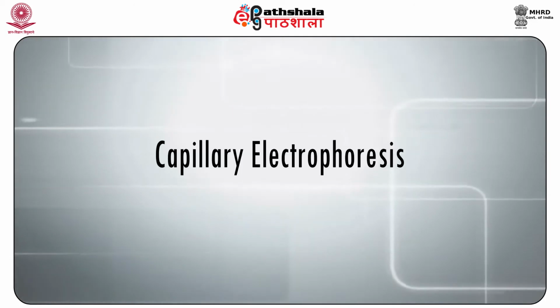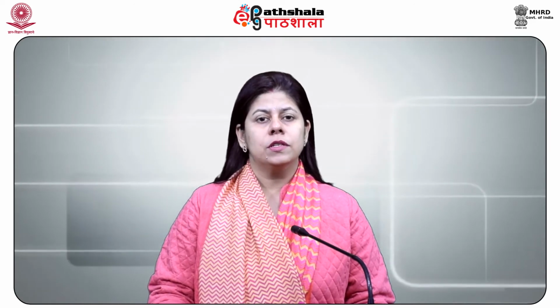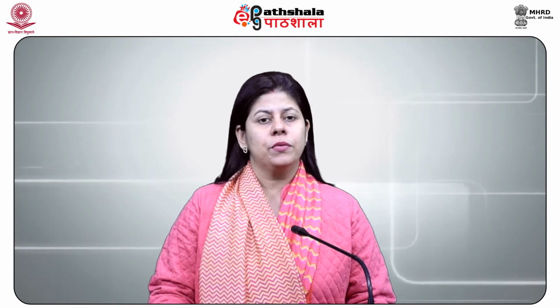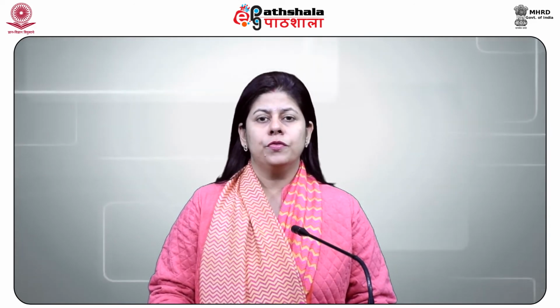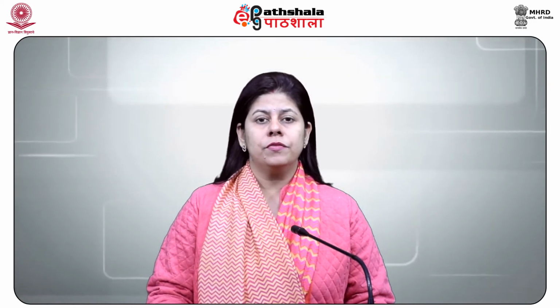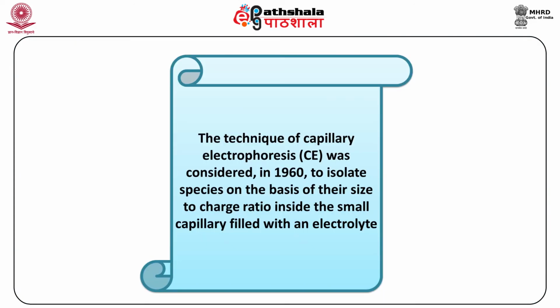Capillary electrophoresis. Capillary electrophoresis can be applied to separate ionic species by their charge and frictional forces and the hydrodynamic radius. In standard electrophoresis, electrically charged analytes migrate in a conductive liquid medium under the impact of an electric field. The technique of capillary electrophoresis was considered in 1960 to isolate species on the basis of their size to charge ratio inside a small capillary filled with an electrolyte.